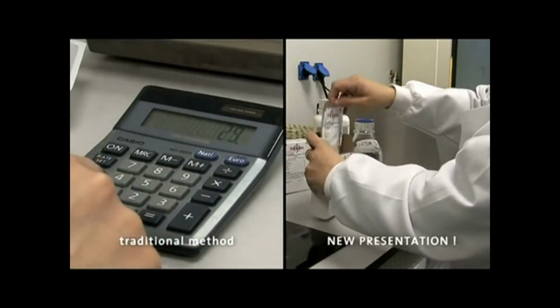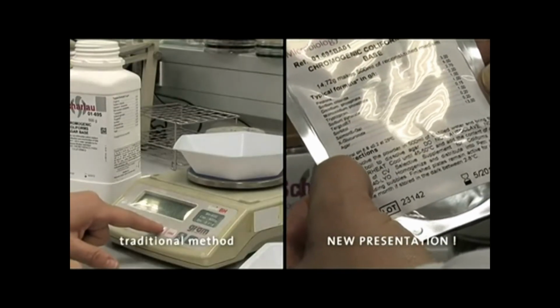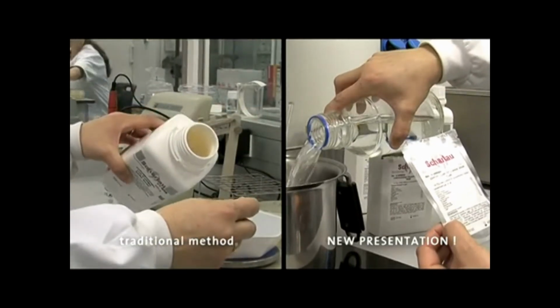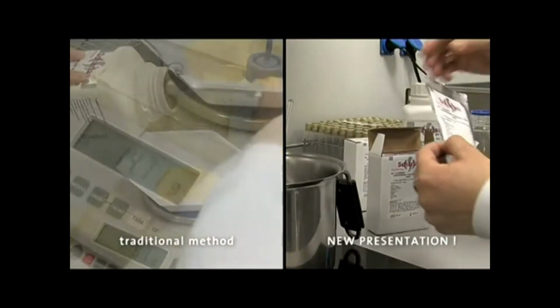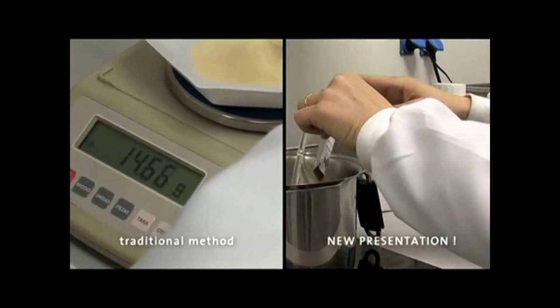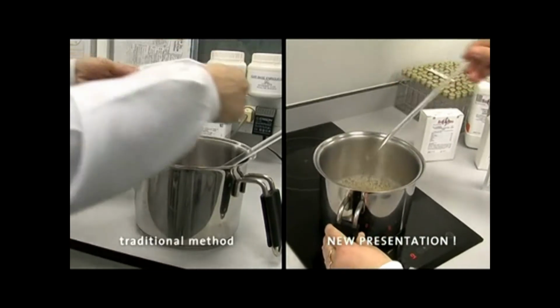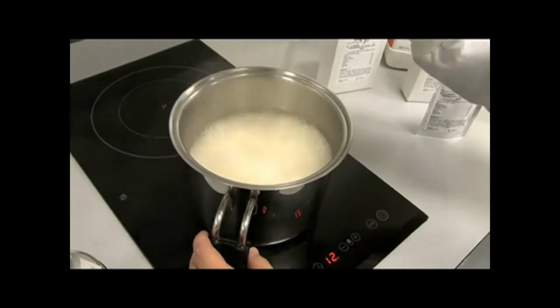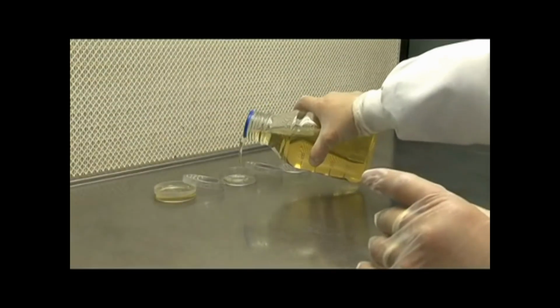Weighing from a standard 500 gram bottle, you have to suspend 29.45 grams of powder in 1 liter of distilled water and bring to the boil. Do not autoclave. Do not overheat. Cool down to 45-50 degrees Celsius and add the content of 1 vial of coliform CV selective supplement for coliforms to every 500 milliliters of medium, art. number 6140 LYO. Homogenize and distribute into Petri dishes.